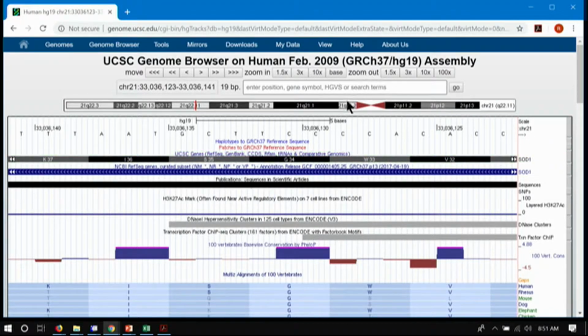He even flipped the ideogram so you can see here the centromere is right of center. The paradigm is P telomere, P arm, centromere, starting at coordinate 0. And so this is flipped, so it puts the P arm on the right. So your acrocentric chromosomes are going to have the centromere over here at the left arm unless it's backward.